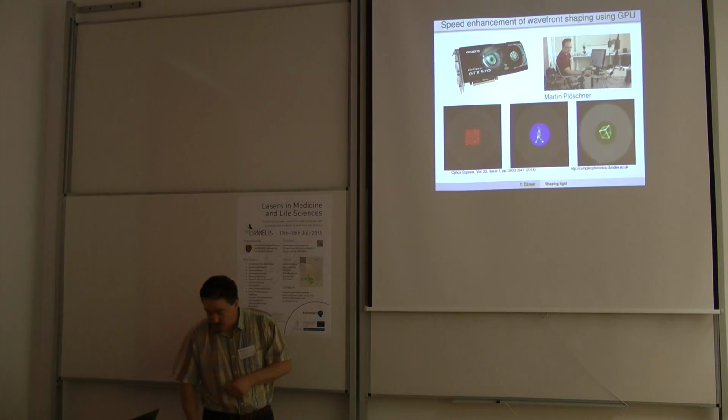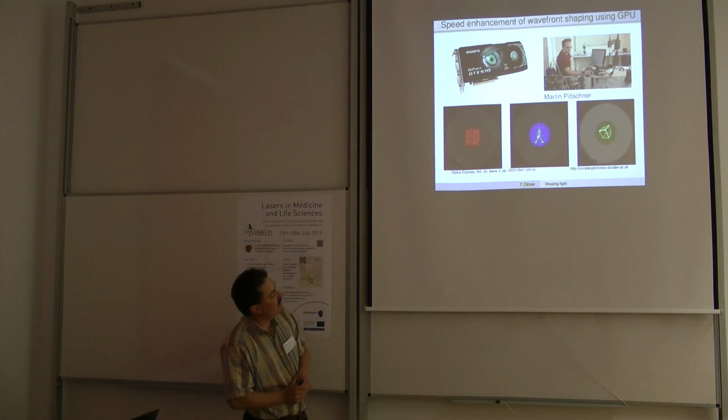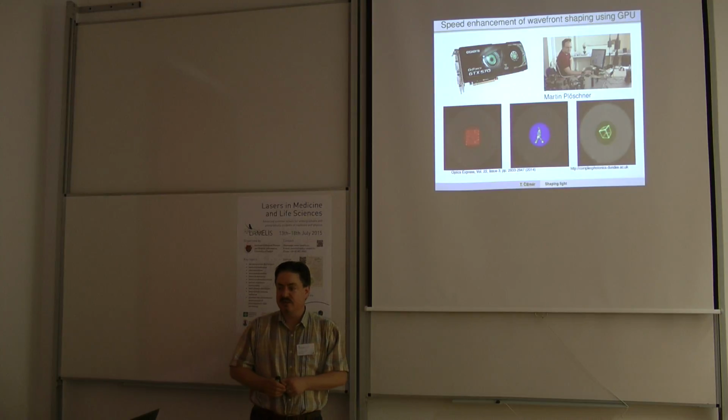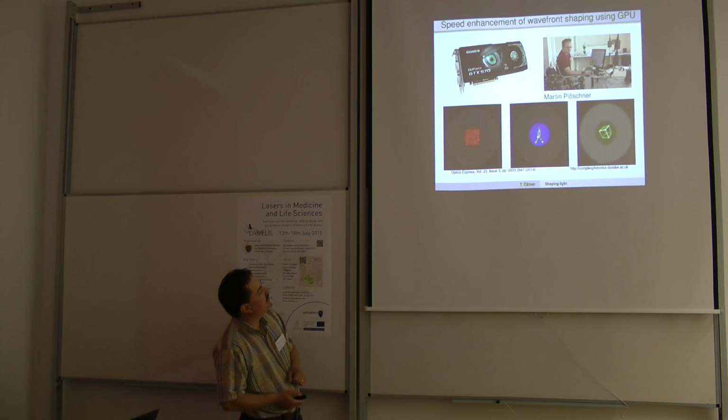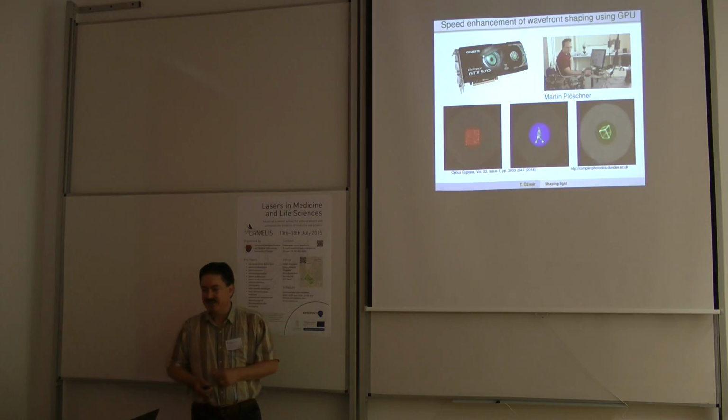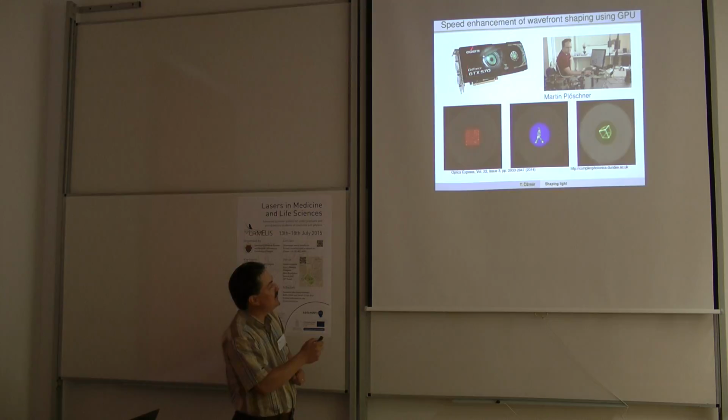So that's quite cool. So the final bit I'm going to say is that we basically need quite some computational power, and the CPU are no longer sufficient for that. If you want to create such complex holographic modulations, you need to look for solutions like GPU, graphic processing units, where you can highly parallelize all these tasks. And all these graphic cards from NVIDIA are actually driven by the gaming industry. So if you play computer games, or if you've got sons or daughters who like to play computer games, don't be too harsh to them because they are contributing to science, right? Because we can then take that and do some really cool stuff.